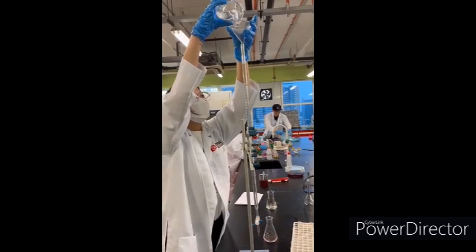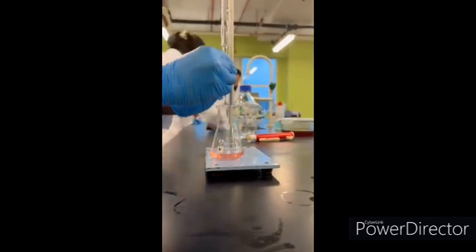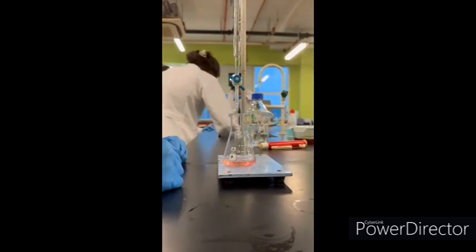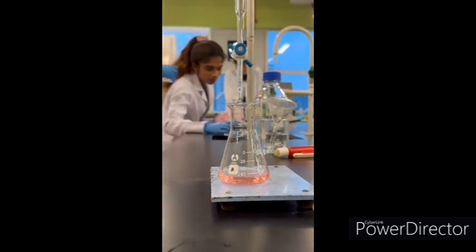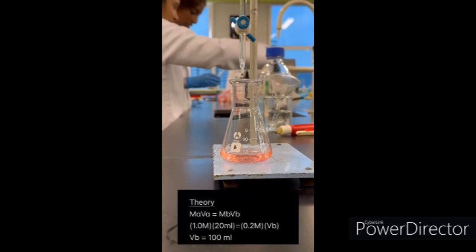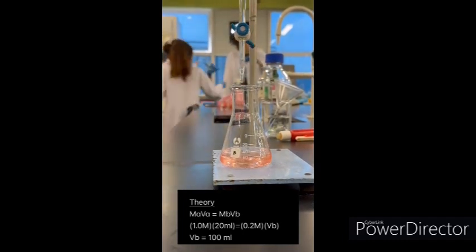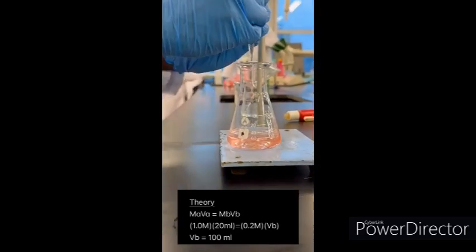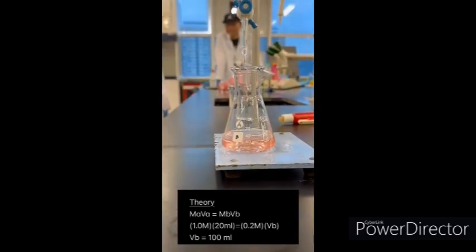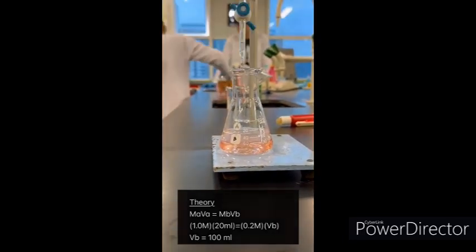For the second sample, the same substance and method were used as in the first experiment to get a more accurate result. Since the molarity and volume of acid and base are known, we can calculate the volume needed to achieve the neutral state, called the endpoint. According to the figure shown, the hydrochloric acid has a molarity of 1.0 molar and the sodium hydroxide has a molarity of 0.2 molar. Since the volume of acid used is 20 milliliters, using the formula M1V1 = M2V2, the volume that should be used is 100 milliliters of sodium hydroxide.